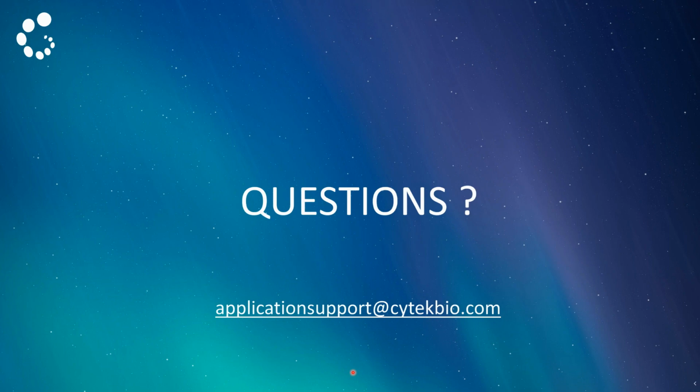Then the user has access to that report of what happened to the installation. If you are asking if you need to run any special tests before you run a sample across multiple sites, then I will say that comparing the QC reports is a good idea, making sure that your instrument is clean. Comparing your QC reports, I will suggest that you contact our wonderful application support team so that we are sure that you're up to go.